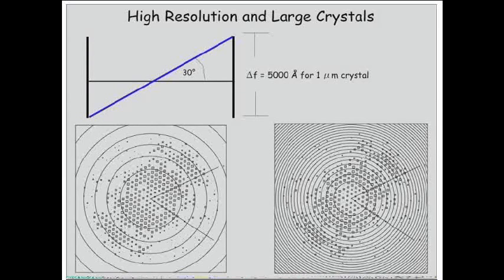So for example, here's some data of ours on one of our crystals, and let's assume that we're down at one end of the crystal, and the defocus is relatively low. So all the spots within this zone have negative amplitude, and then we change to positive amplitude within this zone of the CTF, and we'll go negative, positive. So we've got oscillations in the CTF, which you're completely familiar with. But then go to the other end of the crystal.